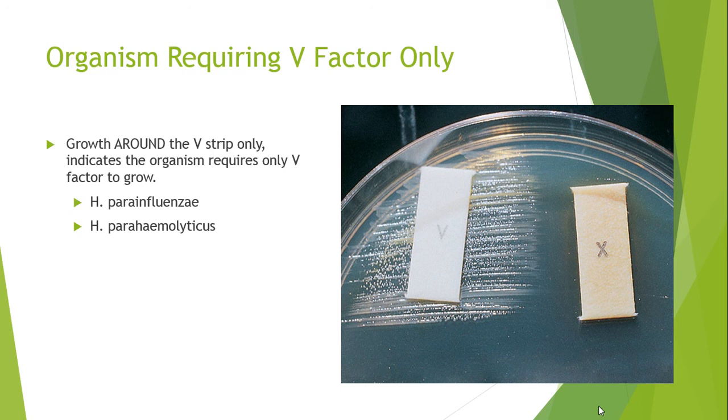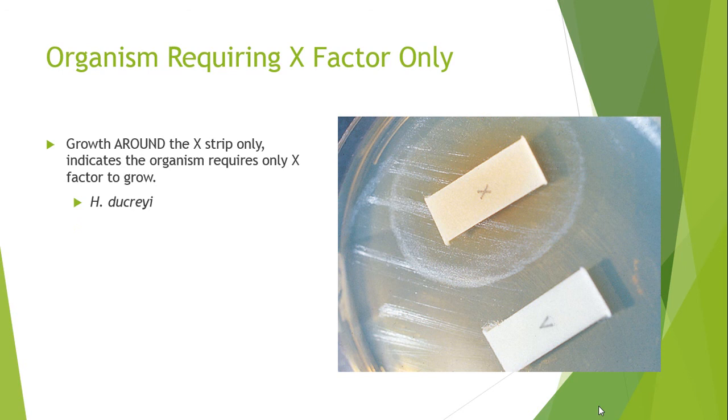Does this make sense to everybody? Okay, well, what if it just needs X factor? Haemophilus ducreyi is our exception, right? So it will only grow around the X factor. We got growth all the way around it.